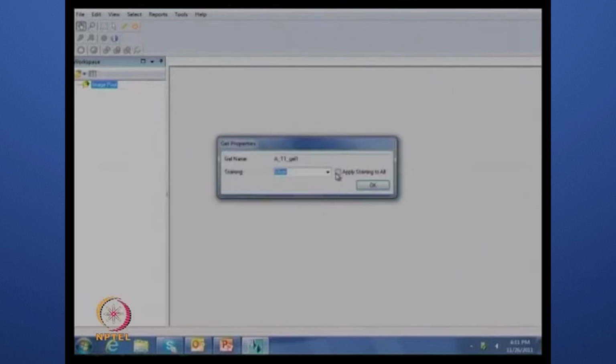So you are processing 6 gels at a time. These are all the 6 gels. Basically, 2 replications, like 3 replications for each gel actually. Right. That means one is control and another is the treated in that way.